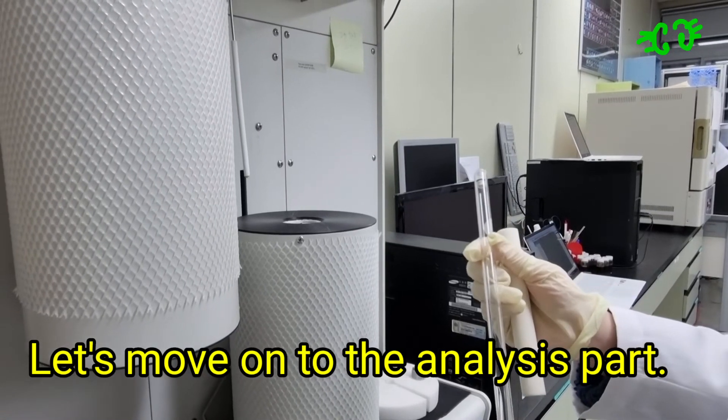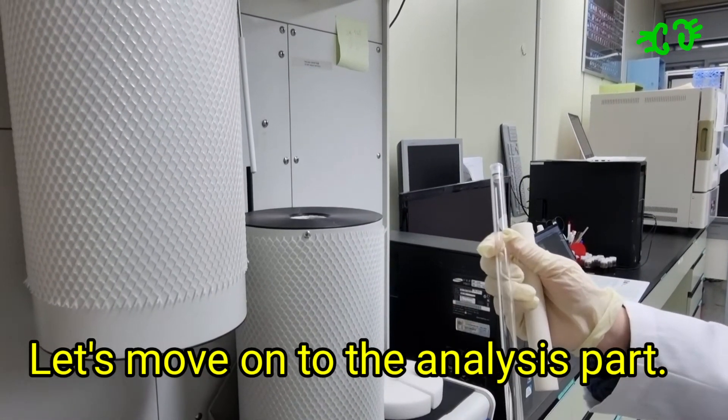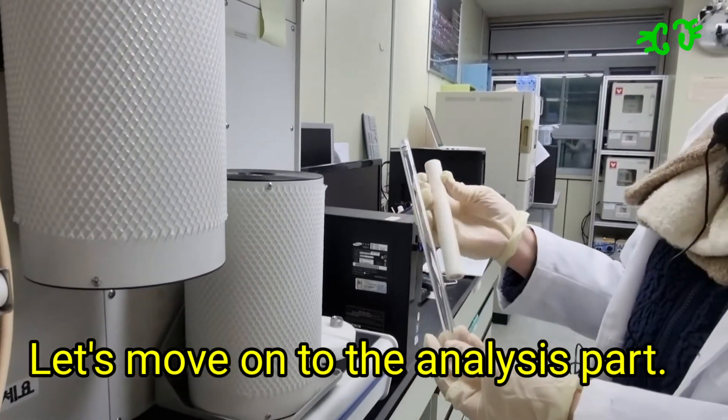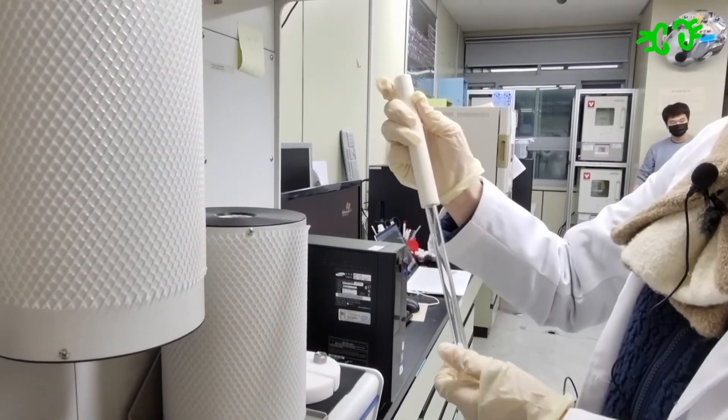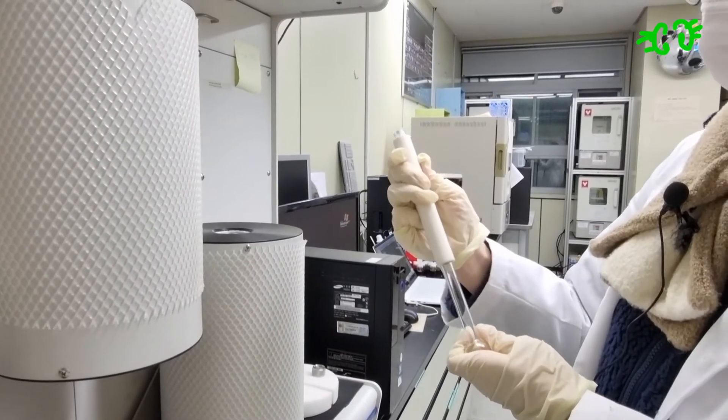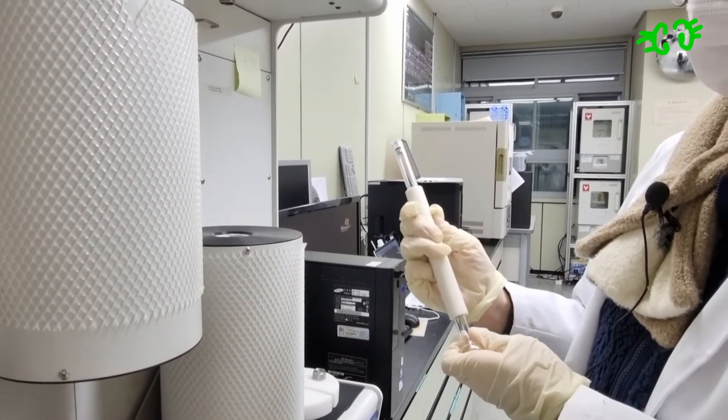To make the temperature same for all places in the sample tube, we use an isothermal jacket. We should put the jacket in the sample tube like this.